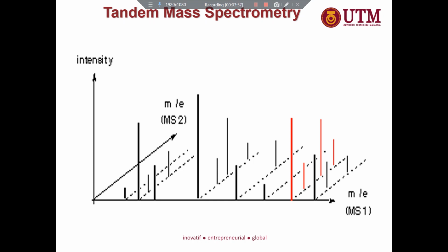From the explosive you only focus, you compare between the mass spectra, on the fragment ion from the explosive that is abundant and also unique from the alcohol. For example, if your explosive is mixed with alcohol, you look at which ions are unique to your explosive, and that is the one you further fragment, you submit as the precursor ion to get the daughter ions. That's why, again, we need to choose the abundant one and the unique one.